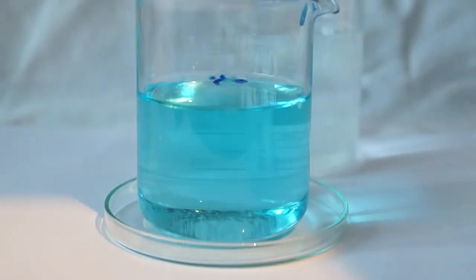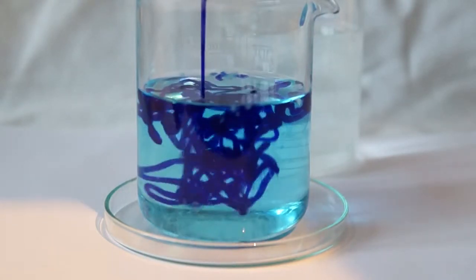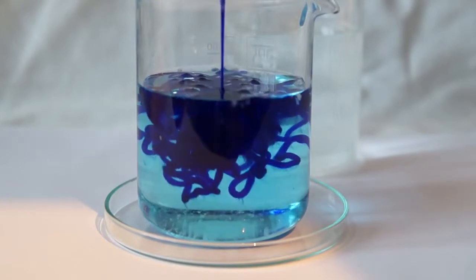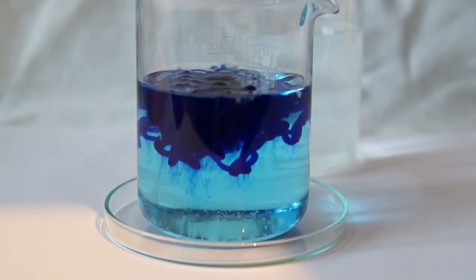Now I pour the rest of the viscose into the sulfuric acid solution. Something similar to vermicelli but with a blue color is formed. These fibers will also become colorless with time, but they will be less durable than fibers extruded through the needle.